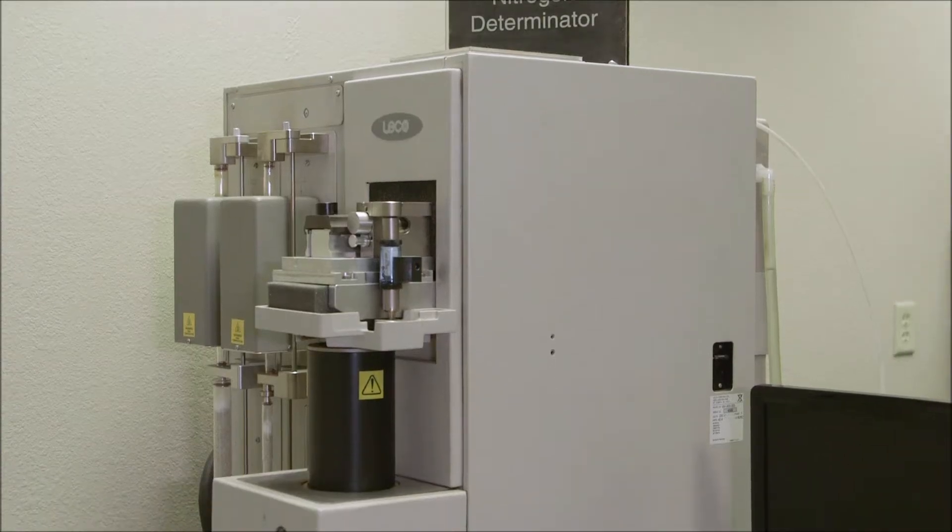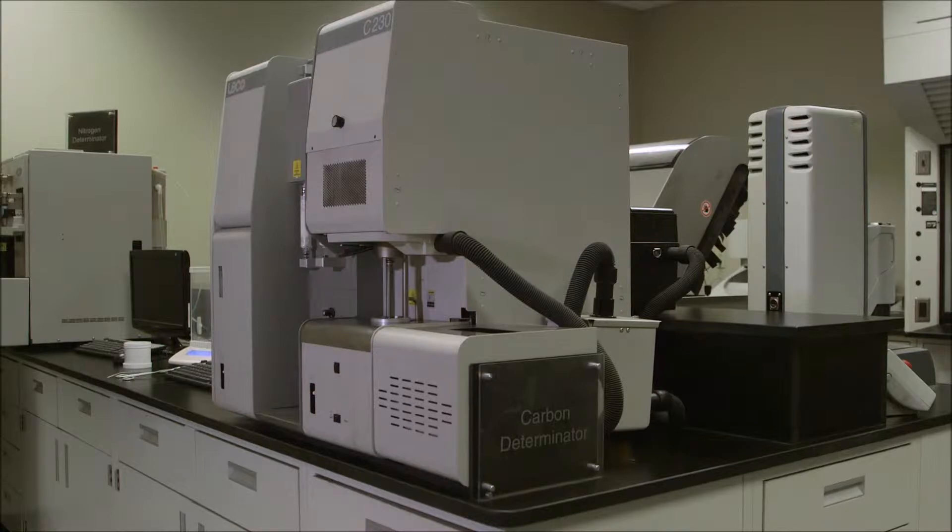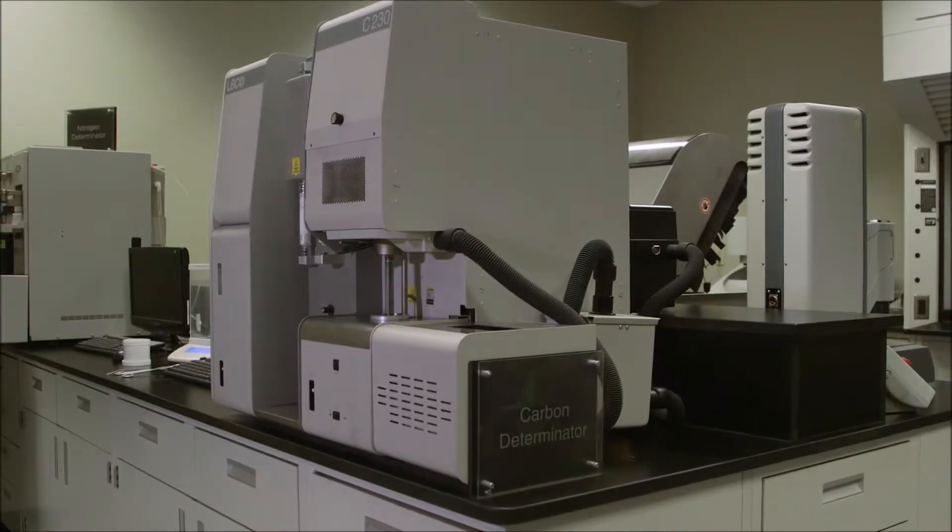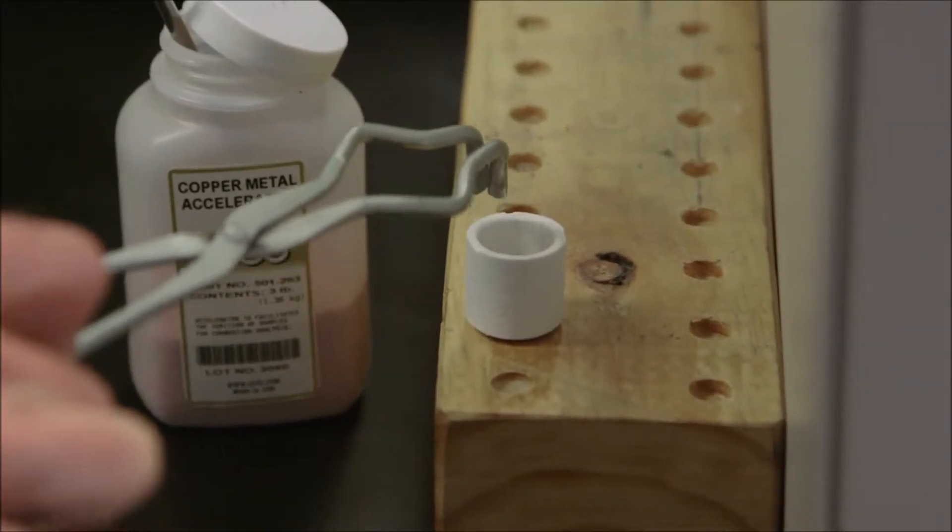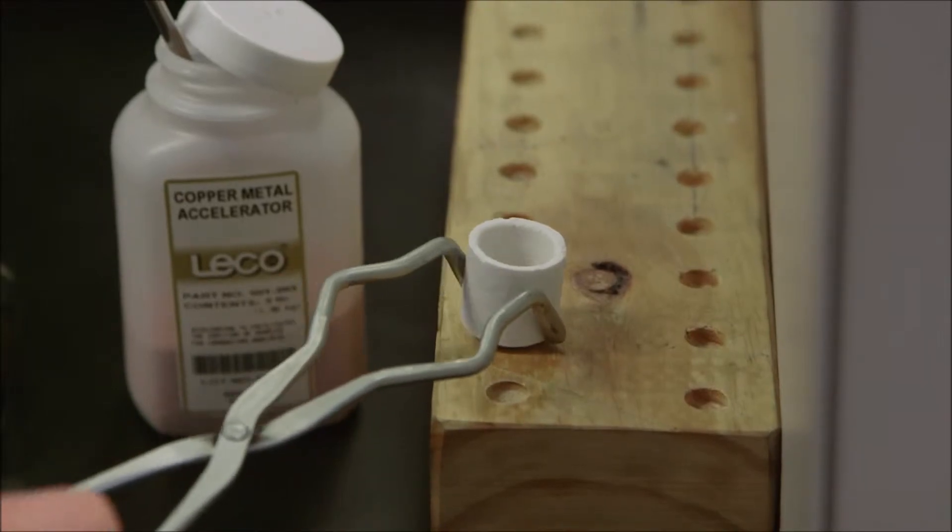While our spectrometer is a great method for identifying the chemical composition of different materials that we use, we also have a LICO nitrogen analyzer and a LICO carbon detector for analyzing these very important small elements that exist within our materials.